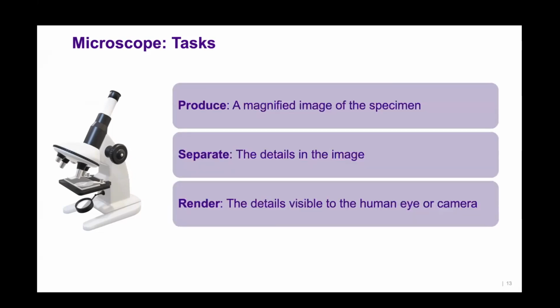Anyone want to tell me? Three tasks, yes. Magnifying, yes. Anything else? Resolution, then? What is resolution? For example, there are two objects, so you see like the border. Brilliant. Yes, how to differentiate or distinguish two objects.